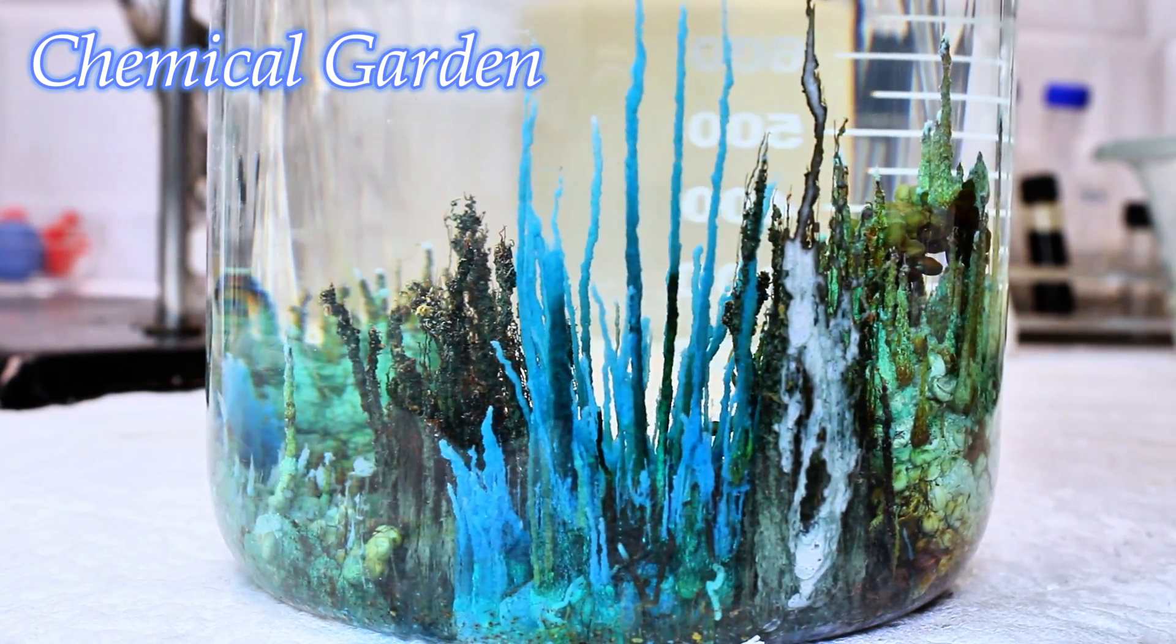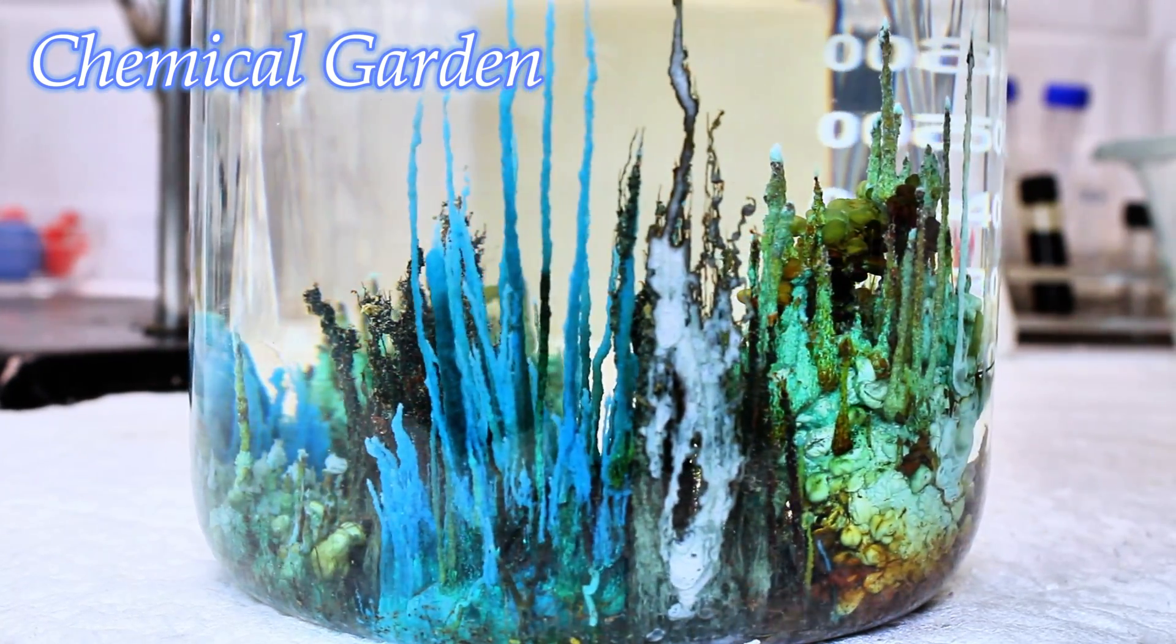Today I'm going to show you how to grow a chemical garden using nothing but sodium silicate and some metal salts.